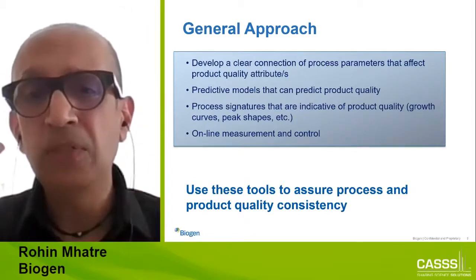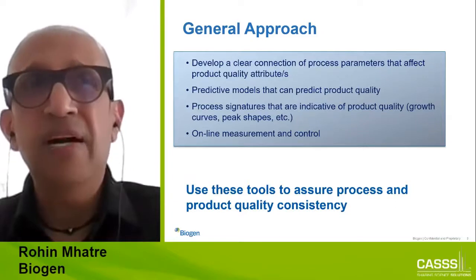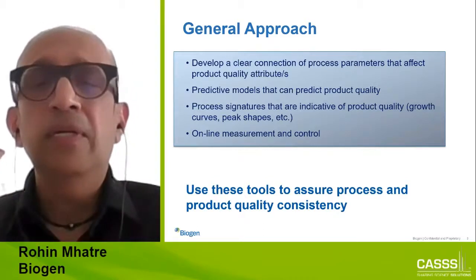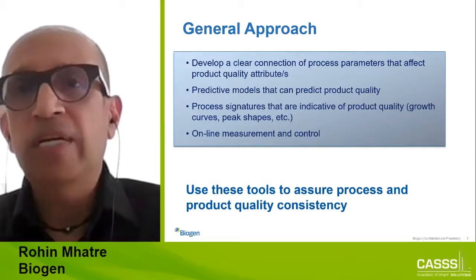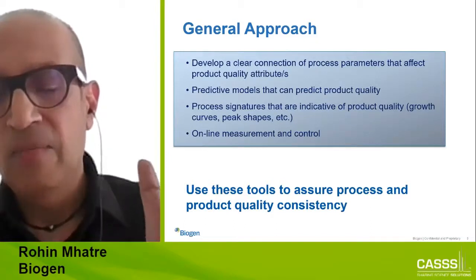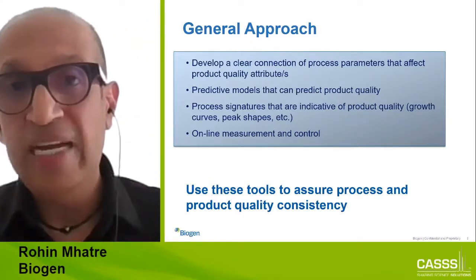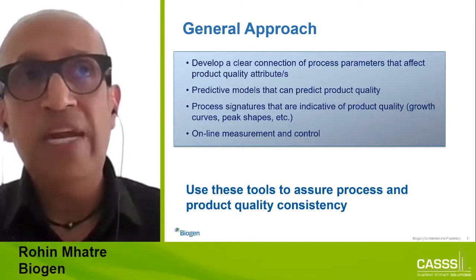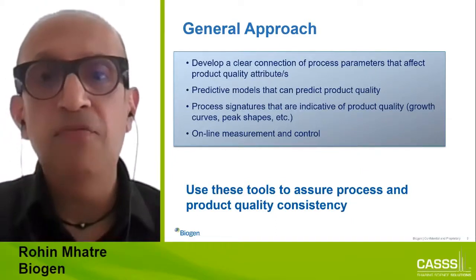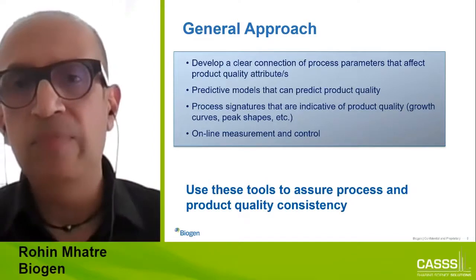And some may ask, why would you want to do that? And this goes back to our production, right? If we are producing at that high a volume, we are seeding reactors very frequently. So what we're trying to get to here is a situation where there are no surprises. So release testing just confirms what we already know. And by knowing where the product is going, I mean, there may be certain unforeseen circumstances, we want to be able to curtail a batch, because not doing that, with the rate of production, you can very easily see 6 or 7 batches not working or having failures if we don't intercept this. So that's really where all this is leading us, and I'll talk a little bit more about that.